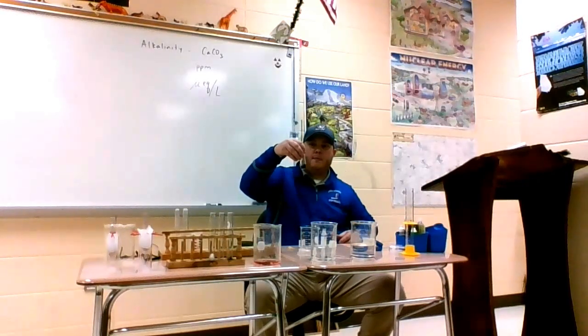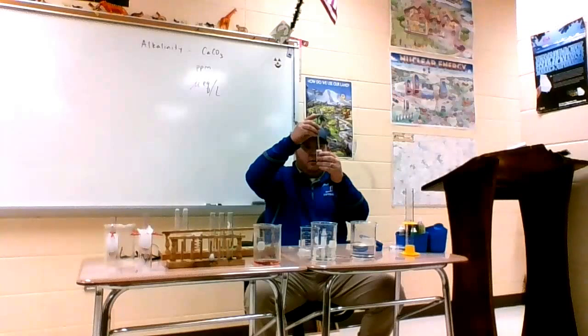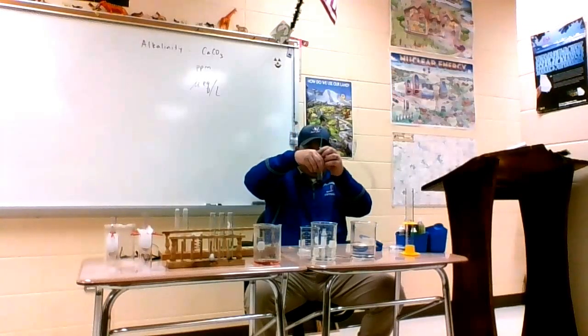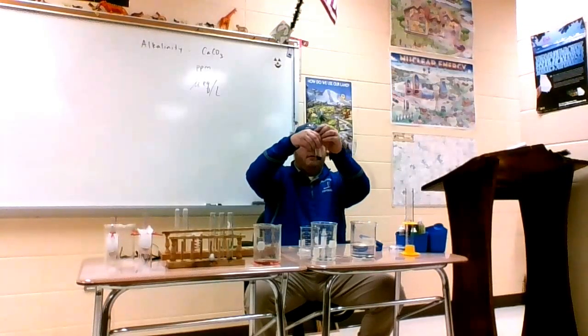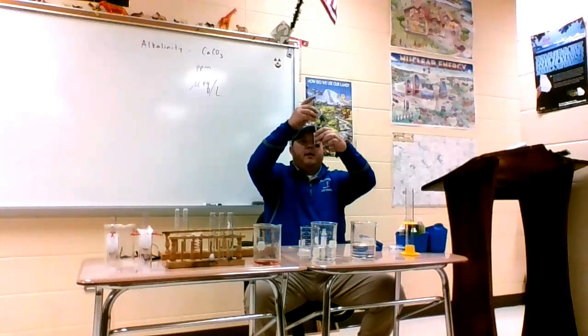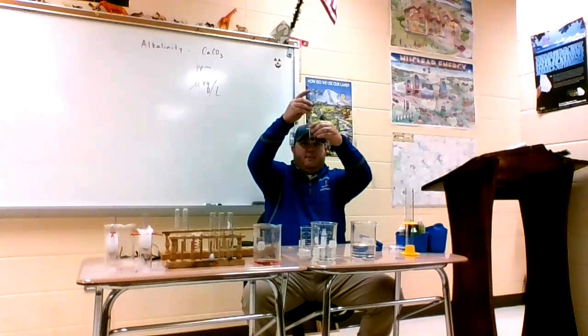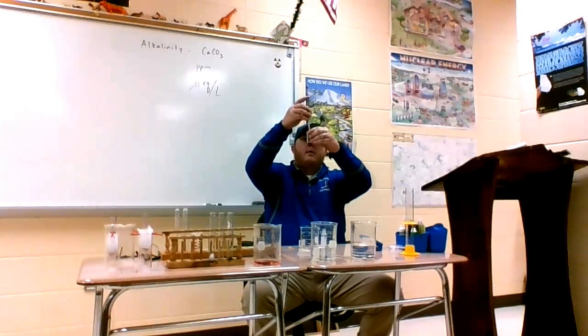Starting to turn. But I hadn't turned yet. There it goes. Ooh, well, pretty. I'd say that's purple, not pink yet. So one more drop. You try. There's pink. Y'all say that's pink, or you want one more? One more. Pour the rest of it in. That's pink. All right, that's pink.